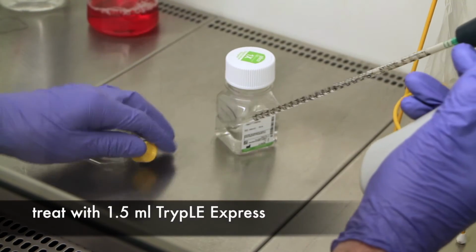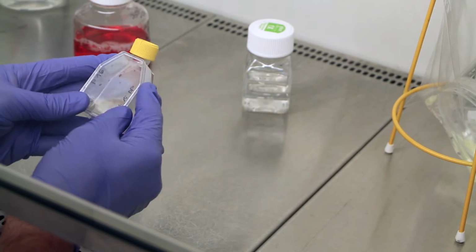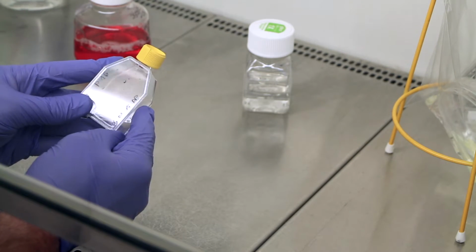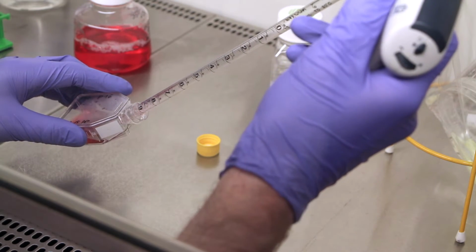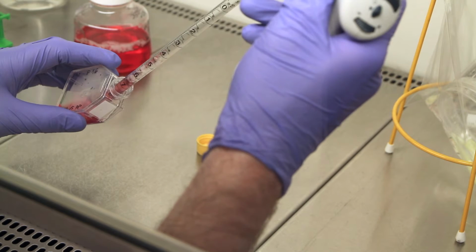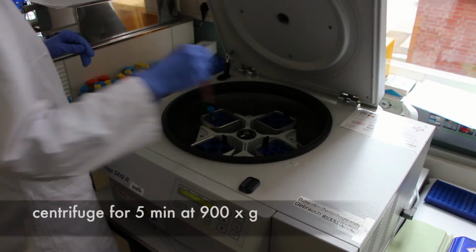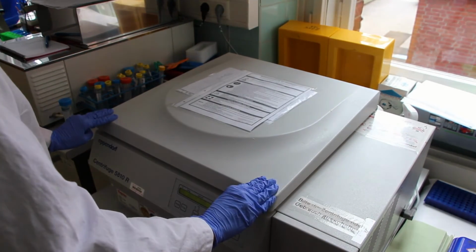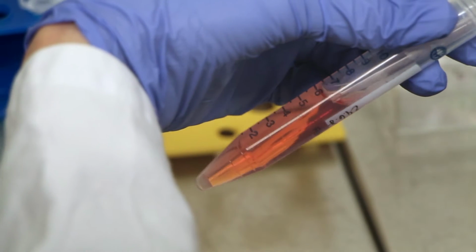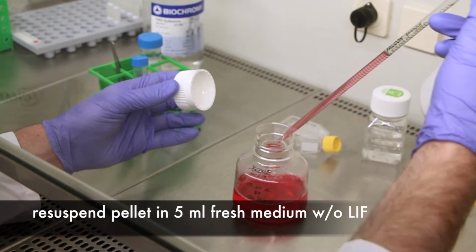To release the cells, 1.5 ml TrypLE Express are added, which is a trypsin substitute. The solution is left in the flask for about 90 seconds until all cells have detached. Remaining cells can be removed by gently shaking and tapping. The reaction is stopped by adding 5 ml of culture medium. The cell suspension obtained is transferred into a centrifuge tube and centrifuged. The supernatant is discarded and the pellet is resuspended with about 5 ml of culture medium to relieve the cells from TrypLE.